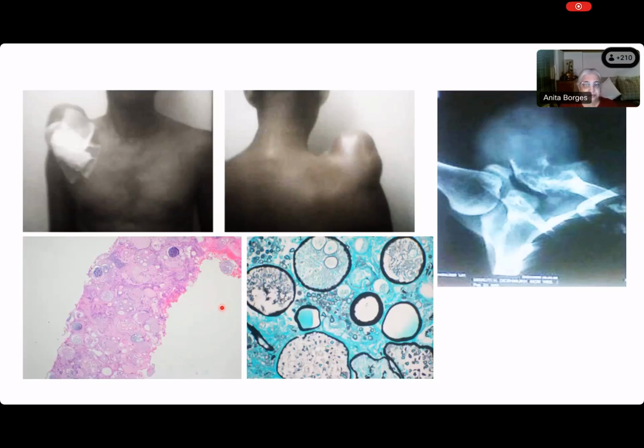Prayas, do you know what this is? Is Prayas there or has he left? Yes, ma'am. You're there. So what are you seeing over here, Prayas? Can you describe it? And there must be people in the chat box who are writing over there. But if Prayas can't answer, then Zara, would you like to take a try and say what this is? Histoplasmosis. Sorry, Prayas, what did you say? Is it, ma'am, histoplasmosis? Prayas, you're not describing this. You're just trying to match pictures in your head. Would you like to describe it, Prayas?